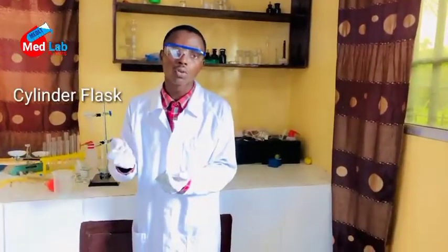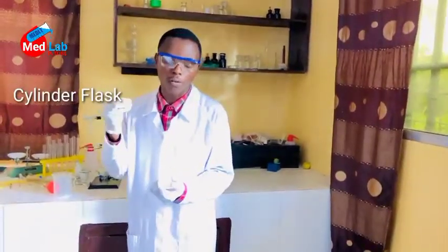Good. This is the cylinder flask. Now the cylinder flask is used to measure the volume of liquid. It is used to measure the volume of liquid. This is the most recommended and appropriate apparatus to measure liquid. So, never use a beaker to measure where you have the cylinder flask. Never use a conical flask to measure where you have the cylinder flask. This is the appropriate apparatus for measurement.